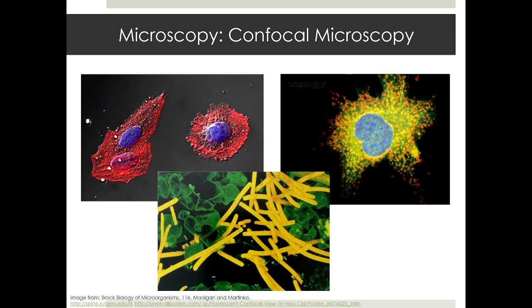And here you can really see the effect of confocal microscopy, where you can definitely see depth. It's not very much because these are, again, very tiny cells, but you can definitely see the parts that are higher up, ones that are further away, even if it's just a very, very small distance, right, relative to the world that we're looking into. You're able to achieve quite a lot more detail in these types of images versus your standard bright field.